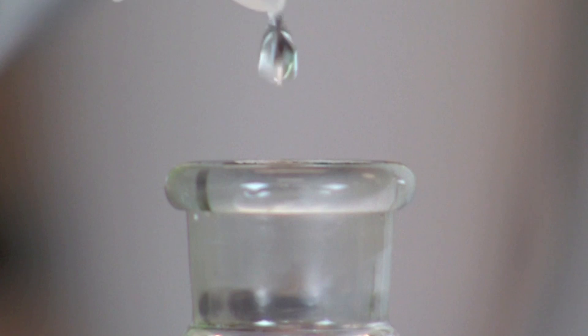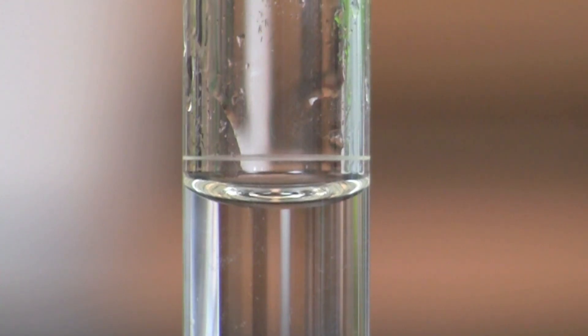Using a dropper bottle or transfer pipette makes it easier to add water drop by drop when near the etch mark.